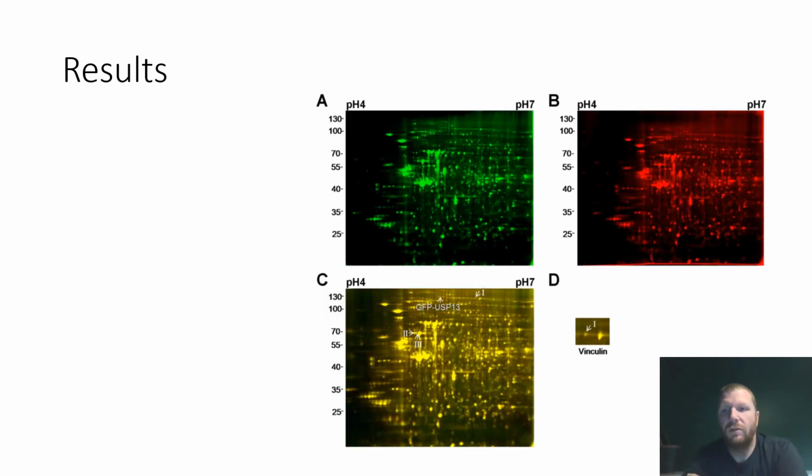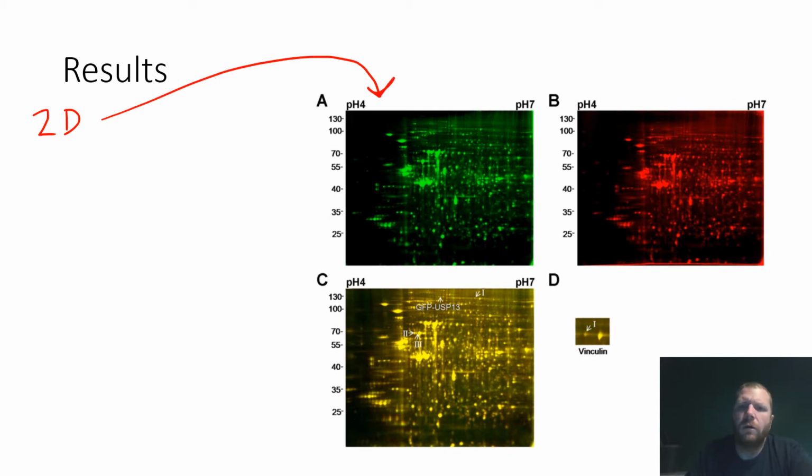Okay, so what do figures for this actually look like? This is what one of these figures looks like. Now what's worth noting is, when we compare the two different dyes, that's our differential. What we haven't talked about is the 2D part of our name. That two-dimensional is right here and right here.